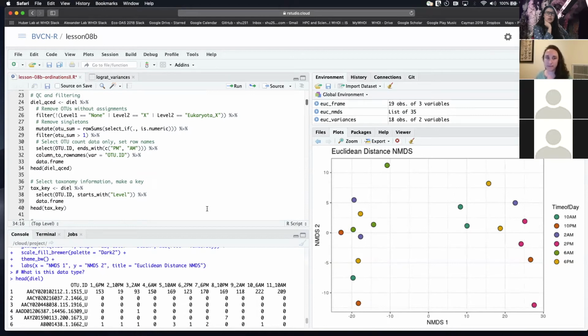And I think just as a quick survey, the last couple of data sets that I'm currently working on and have worked on had an outlier because, when I looked at how many sequences were recovered, it was like a couple hundred sequences, while everything else had over 8,000 sequences recovered.